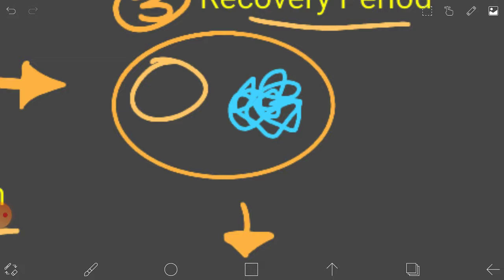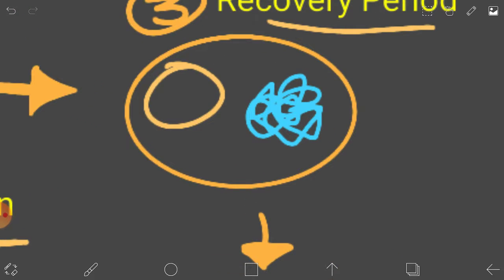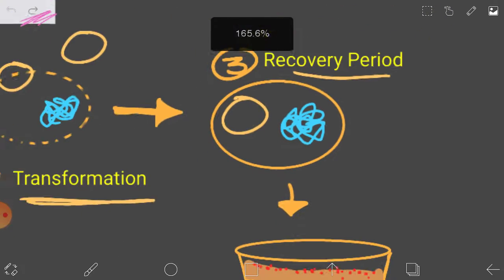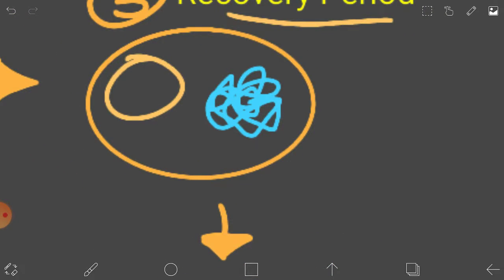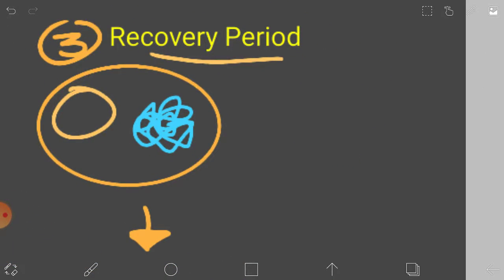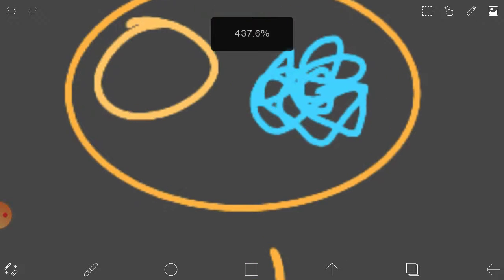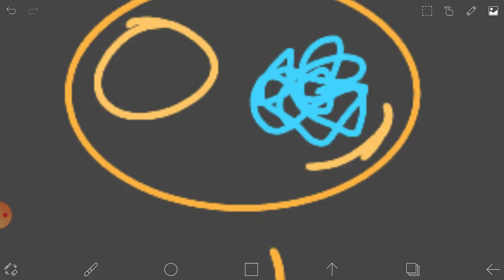It doesn't seem like the bacteria becomes less permeable to any other outside DNA, but I'm just assuming that it does close up or go back to how it was before the competent cell propagation, except with the plasmids inside it. During this recovery period, it's placed in a liquid medium so that the plasmids can actually acquaint itself with the genes or the original genes.